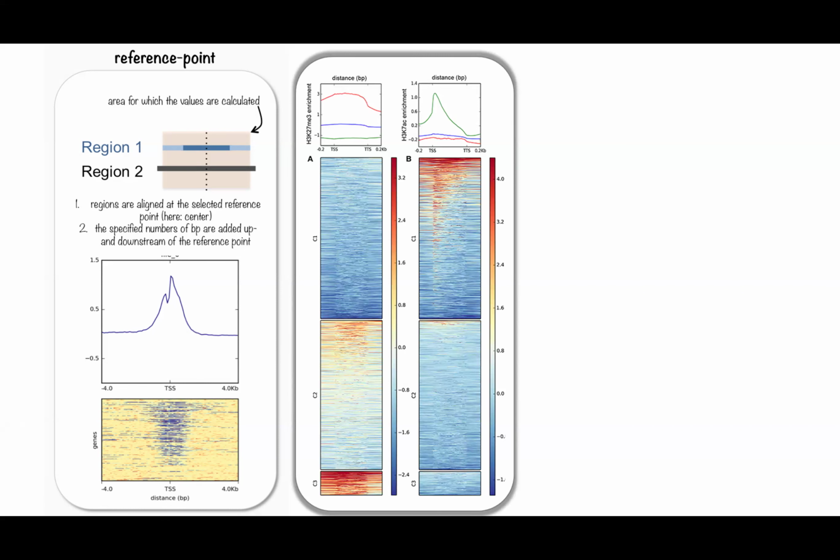And you can run those for different histone marks at the same time. So here we have K27 trimethylation, and here we have K27 acetylation. These are repressive and active marks respectively. Here they put the transcription start site on the left and the transcription termination site on the right. I shouldn't use this example because I didn't talk about it. They also have a mode where you can give information like that, and it will stretch or condense the gene based on that. So it's proportional between those two, but not necessarily linear, because some genes are bigger than others.